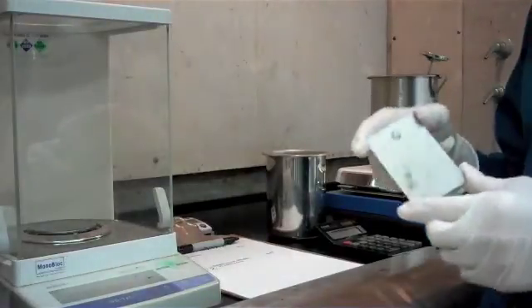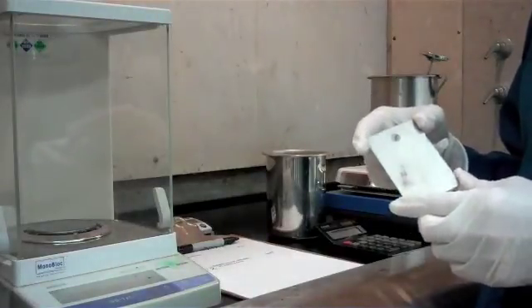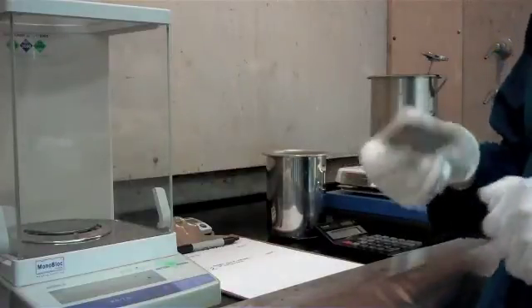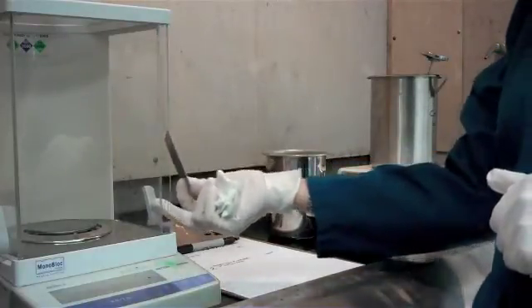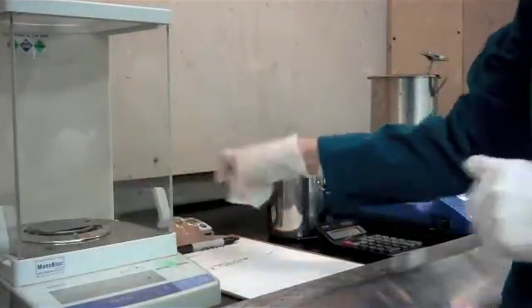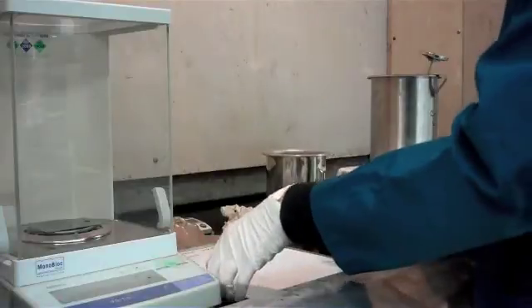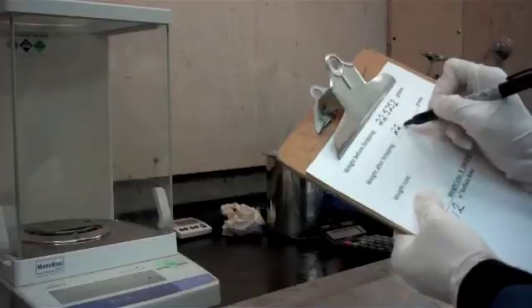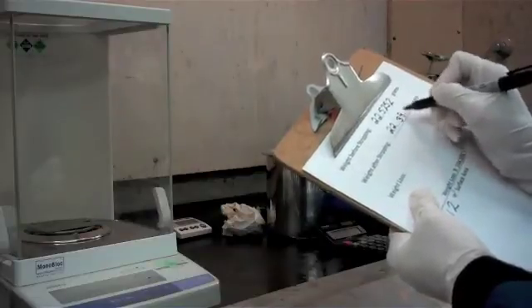Our panel has been rinsed after our chromic acid dip and dried and cooled to room temperature, so the last thing we need to do before we do our calculations is take a weight on the panel after stripping. We're going to record that weight — 22.3924.